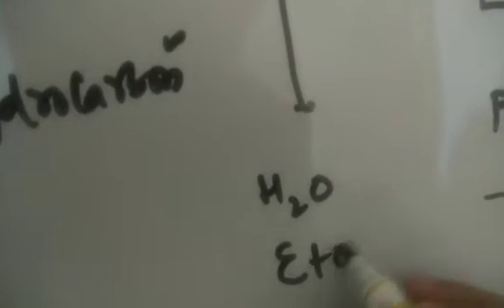That means the stationary phase is now less polar, and we can say it is non-polar. So that's number one. And what solvents do we use? Which mobile phase do we use? The mobile phase consists of polar compounds like water, like methanol or ethanol most commonly, and so on.